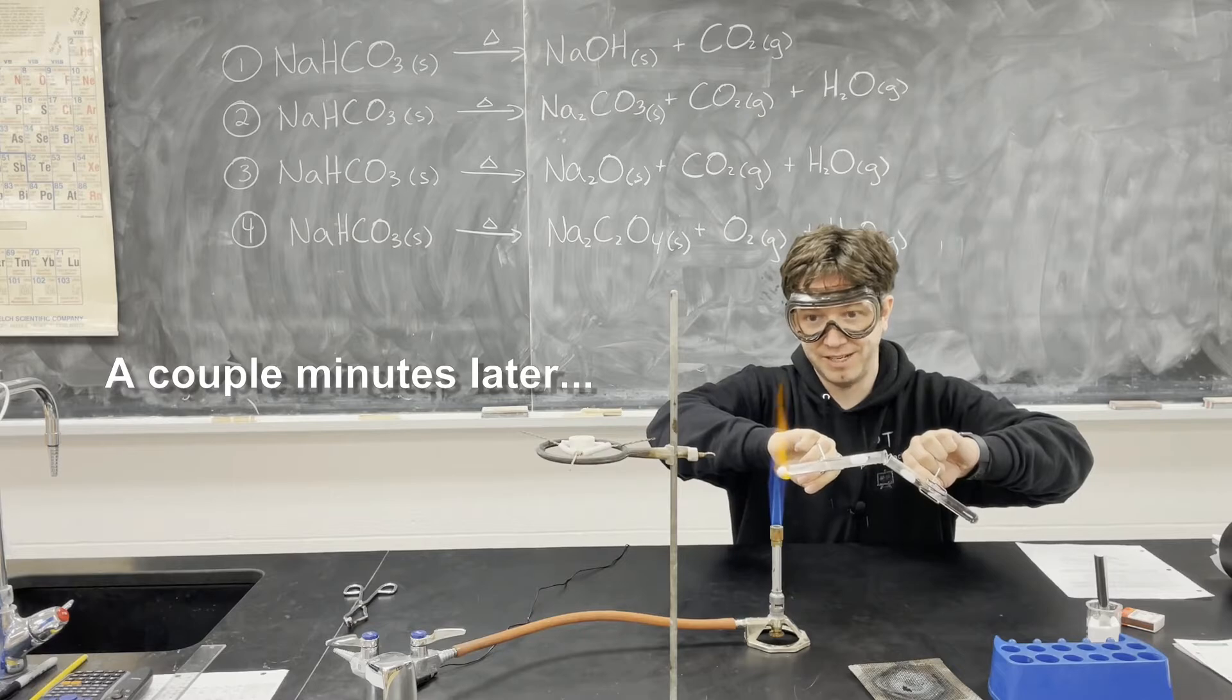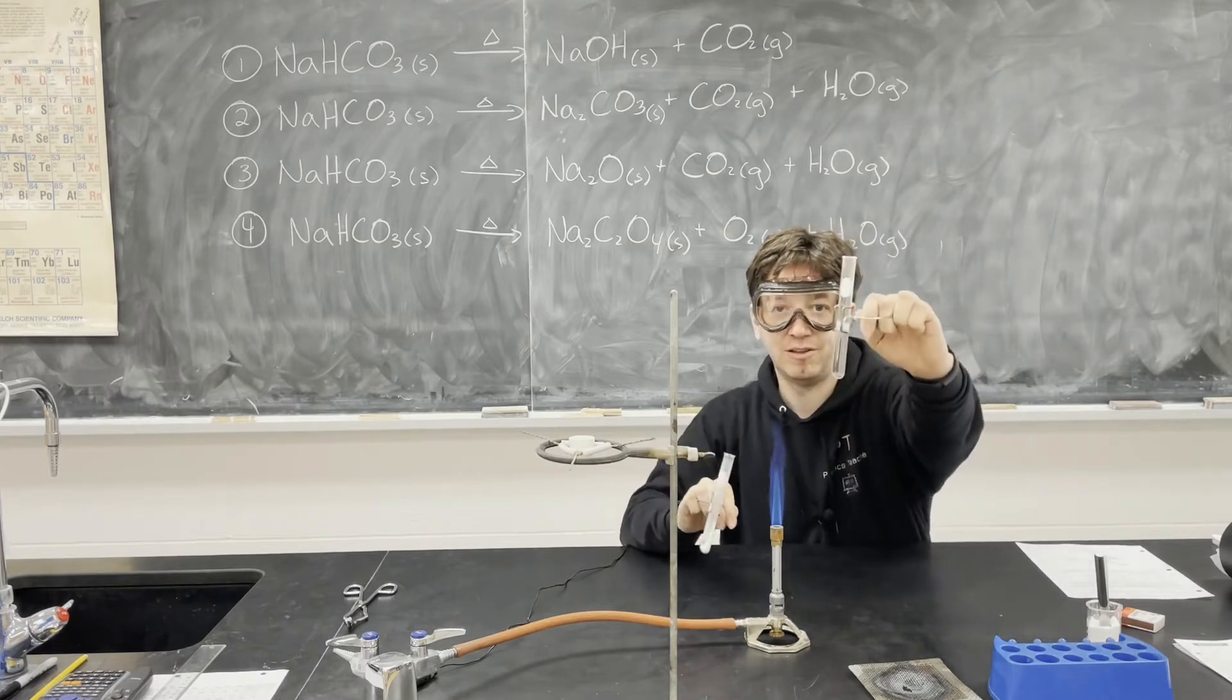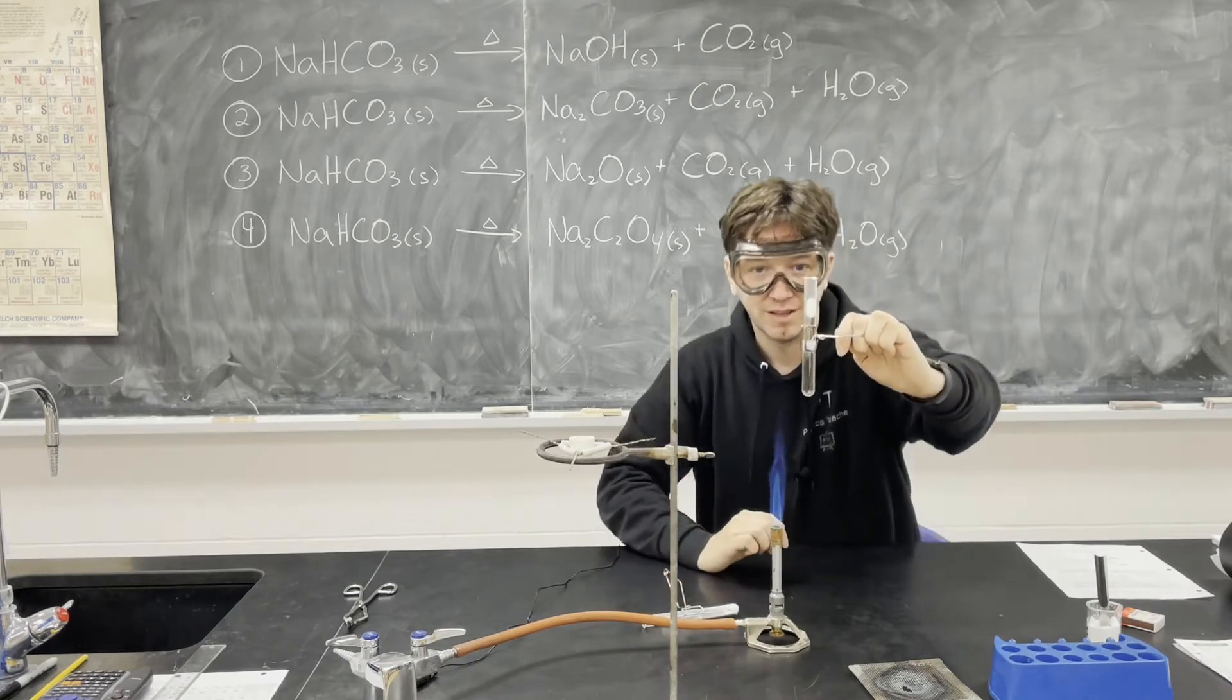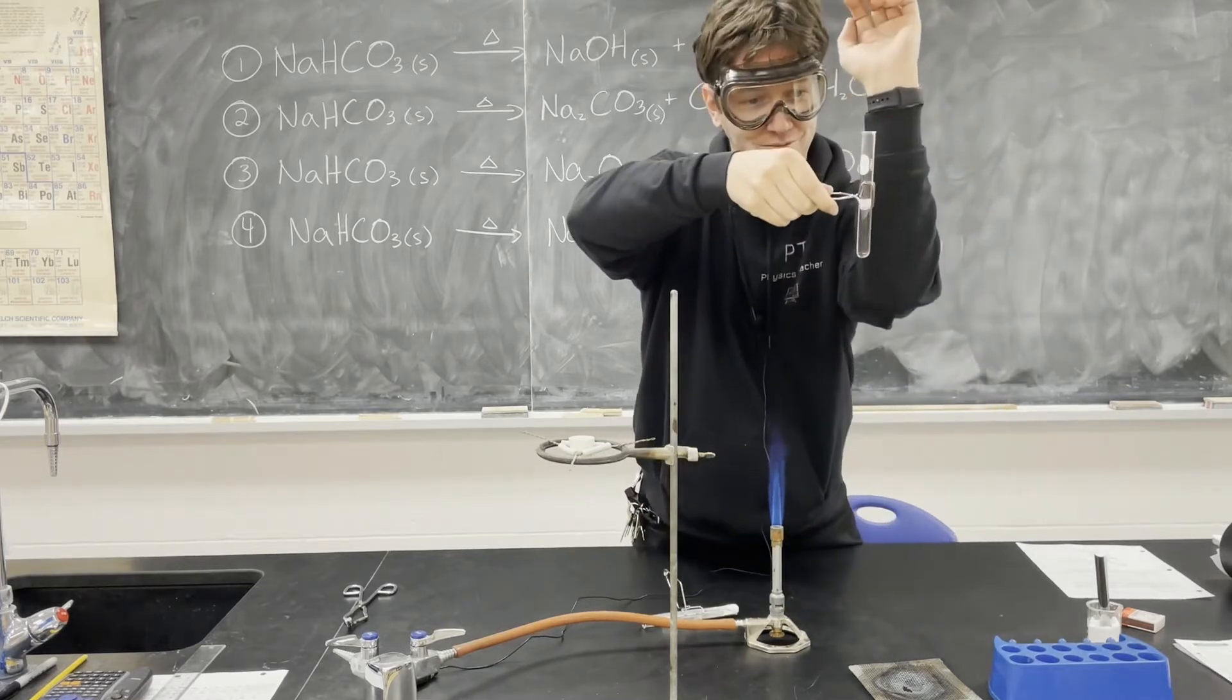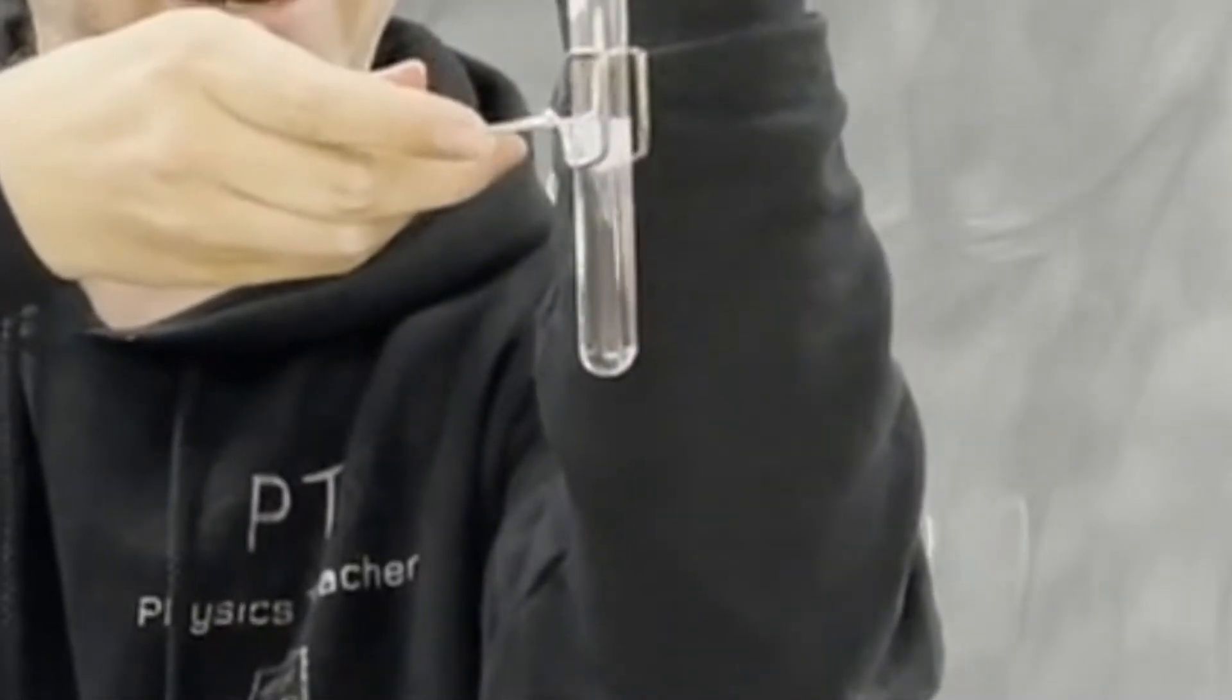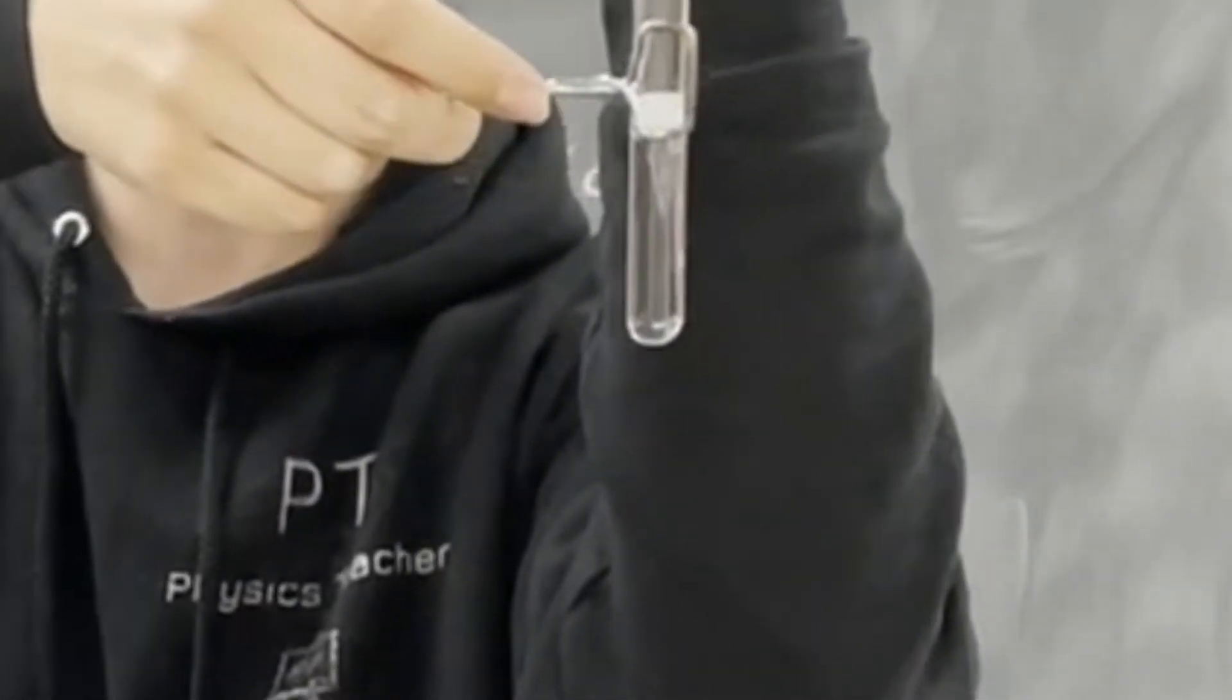All right, let's see if we get a precipitate. Three, two, one. All right, there you go. It may be easier to see against my black shirt, but you can see the swirls forming as it goes down, so we got a slightly clouded color of a precipitate.